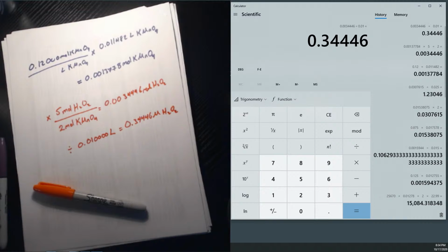You can discover the strength of acids and bases. You can discover the chemical activity, which you don't even really cover until grad school. There's a lot you can do that comes down to just your ability to measure. And titration is one of those basic tools that has a lot of analytical power behind it.